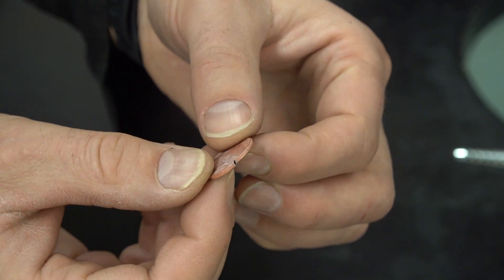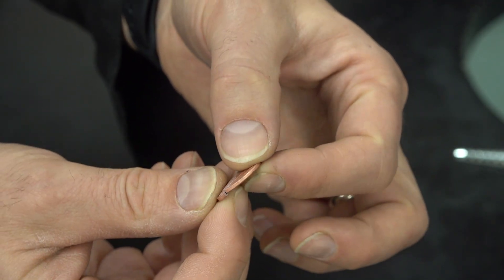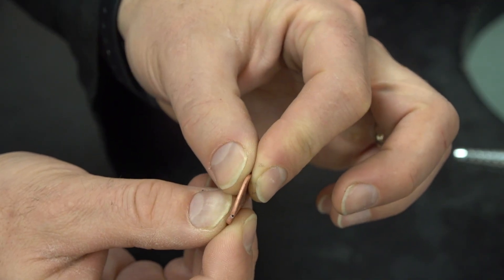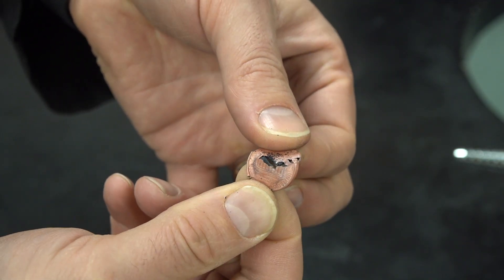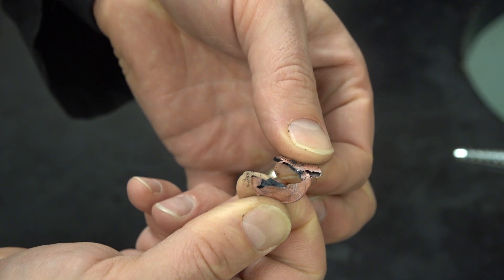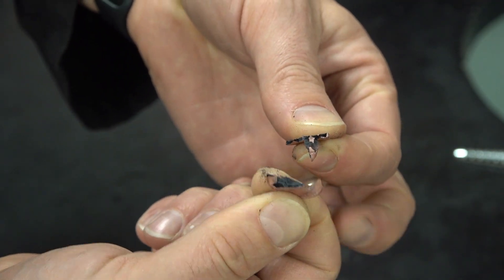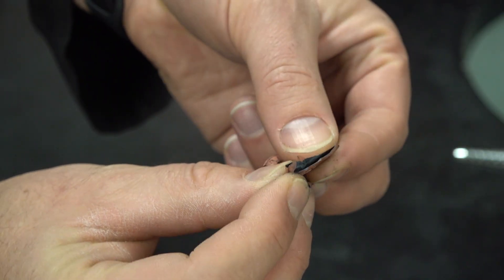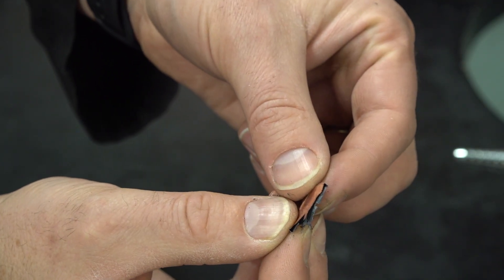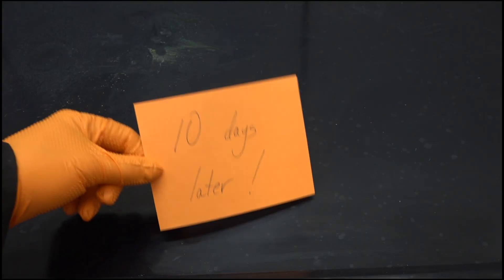This is what we get after we let it sit in there for a while. This is the post-1982 penny. Look at this. Look at that. It's hollow. There's still some zinc inside, but for the most part, it's hollow. You can see that copper plating on the outside of the penny. I decided, well, let's leave these in for a good long time. How about 10 days and see what happens.